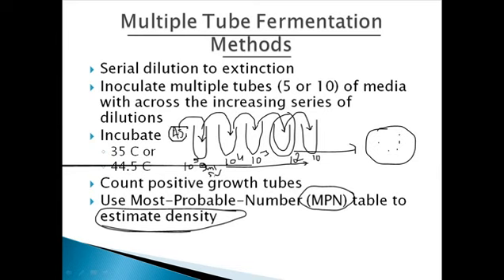Okay. So why does it have another implication? If we take this actual sample and plate it directly, then you can probably find a large number of colonies, because one single bacterium can give rise to a colony. So that's why we talk about colony forming units, equal to one bacterium.